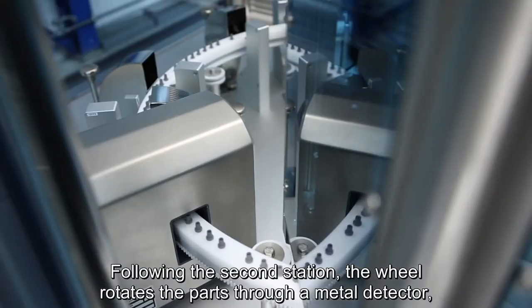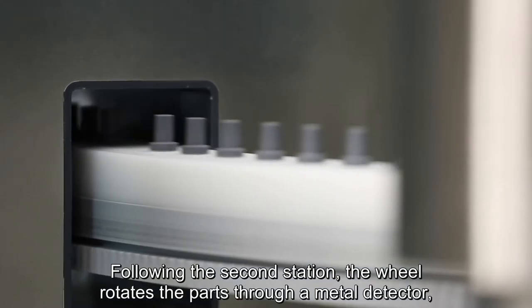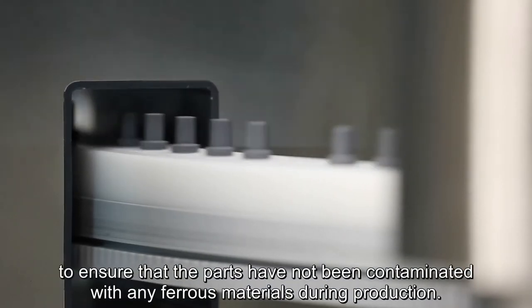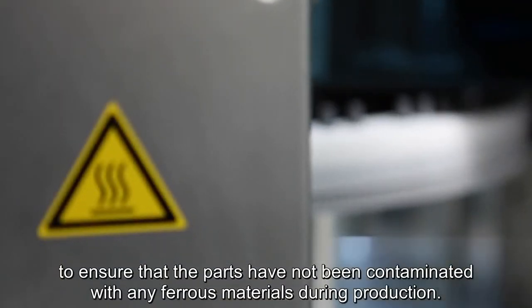Following the second station, the wheel rotates the parts through a metal detector to ensure that parts have not been contaminated with any ferrous materials during production.